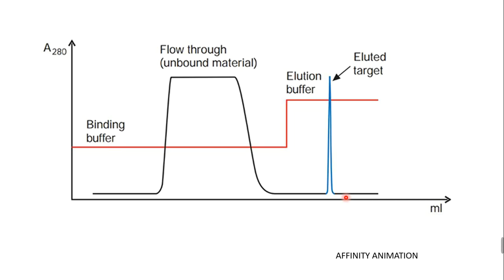So the selection of ligand is very, very important. If you choose wisely, with the specific interaction of your protein of interest, you will get exactly 99% purity here, and based on your technical skill you will get a highly purified fraction. So you will get only a single band in the SDS-PAGE, and with silver staining also. So this is a very famous one.